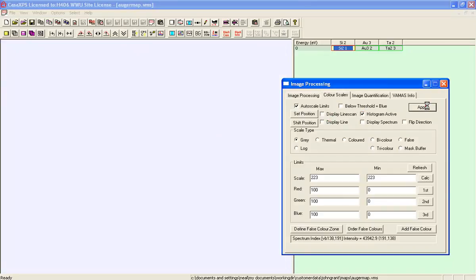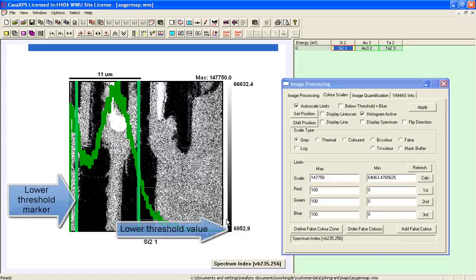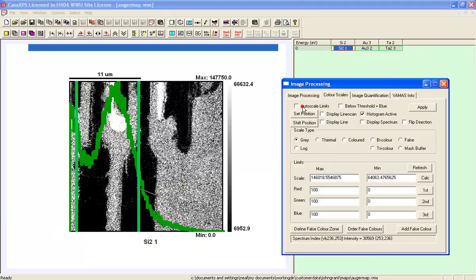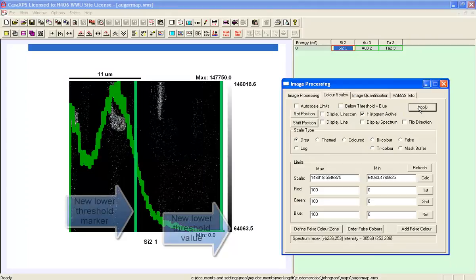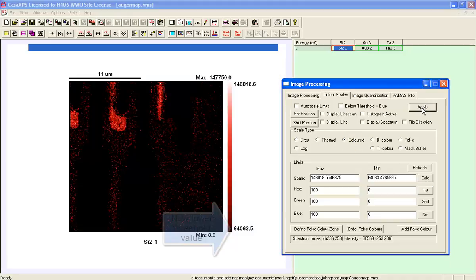But again, we can use the histogram on these Auger images, and we can indicate, for example, the more intense pixels span the more intense interval with the color scale, so we can highlight the features that were just all white in the automatic display.